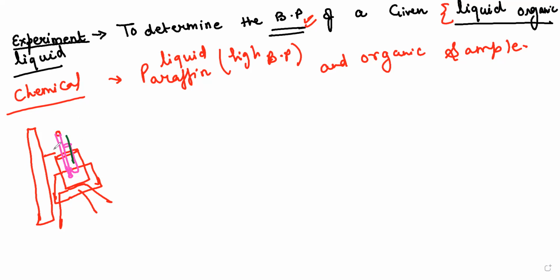Now I'll tell you each and everything. Make sure that everything is properly placed in a secure position. Now we have used a capillary here. This time we don't have a solid product, so why am I using this capillary? You know that a capillary is open at both ends, so make sure that one side is properly secured.